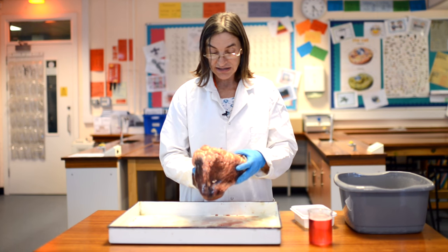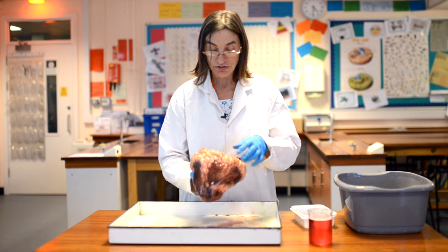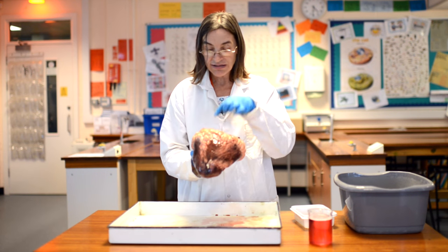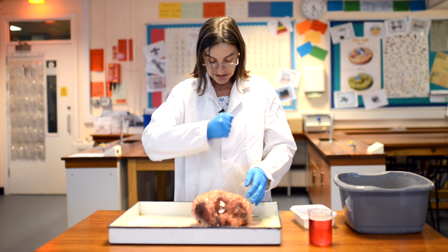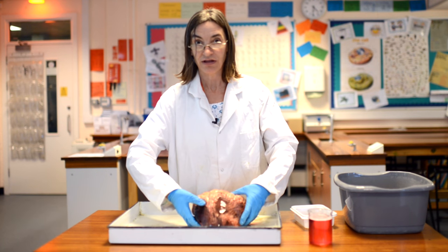You might notice the size of this heart. This is actually an ox heart. Mostly for class dissections, we'd only be able to use a lamb's or a pig's heart, which is much smaller. So this is positioned as it would be if it was my heart. Your own heart, by the way, is about the size of your fist, and it's positioned in the centre, tipped just slightly over to the left.